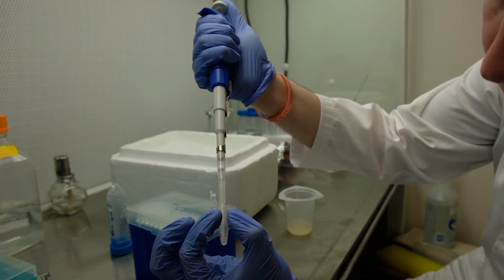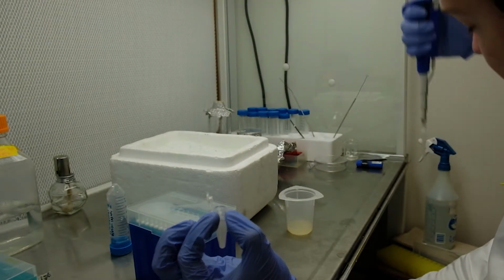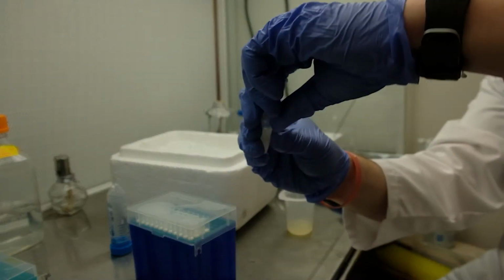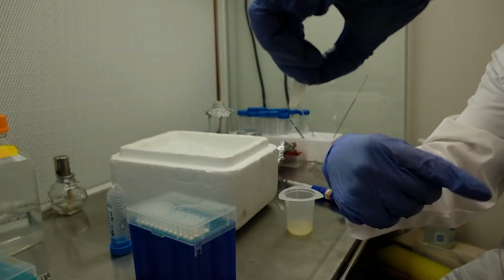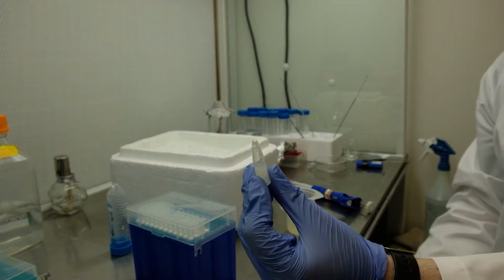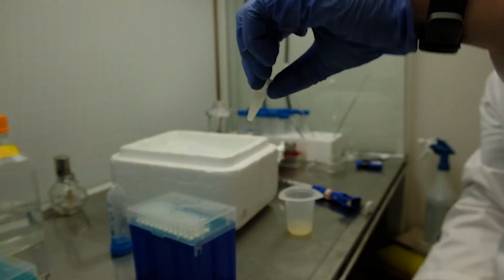You are done when there is no pellet left and instead the entire liquid turns turbid. Flicking the tube again might ensure a more even distribution. The pellet still doesn't seem completely broken, but it should not result in any significant problems.